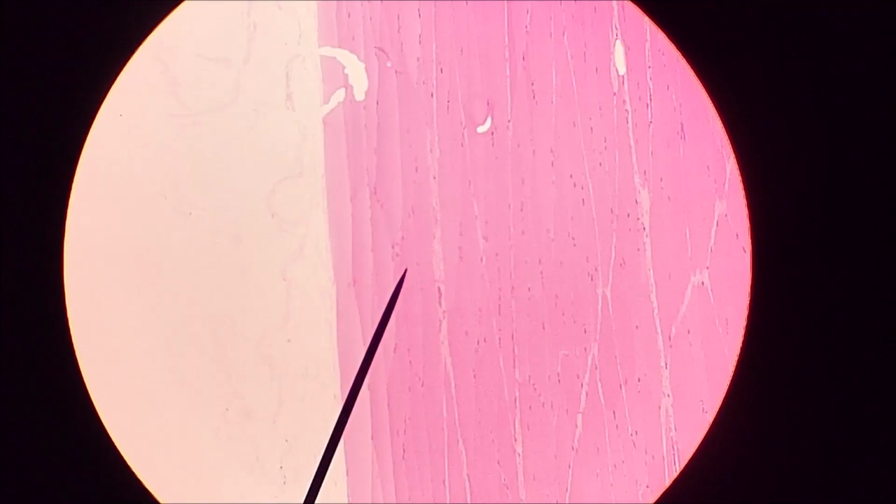What we have here is skeletal muscle. Right, this is as zoomed in as it can be. I hope you can make out the striations there. I can actually drop it down a level. You can kind of see what we're dealing with. So zooming in, there are those nice striations. You should be able to see them pop a little bit.